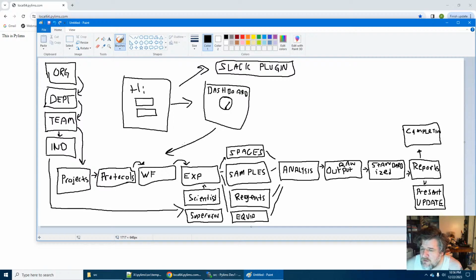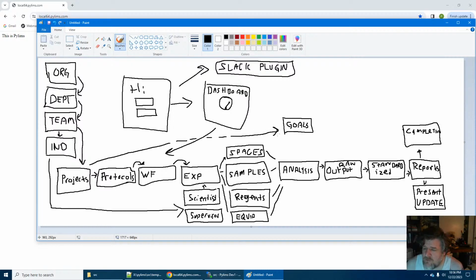So then you should have goals for projects. So project should have goals. And this can be whatever.